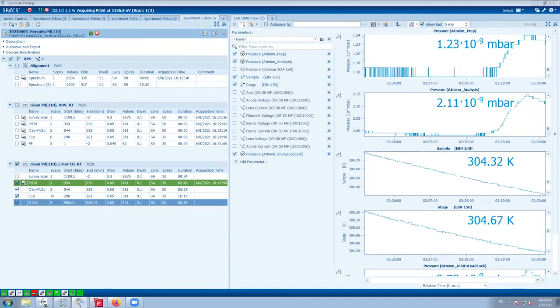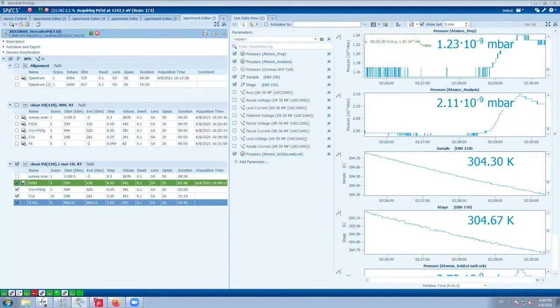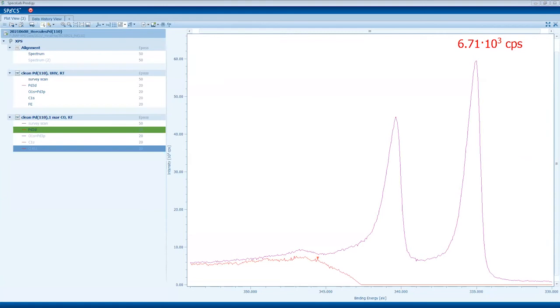You can fill the cell with a pressure of 30 millibars, but to measure it, it's possible maybe on a single crystal, which has a very intense signal. Then even if you have 10% of the signal, it's still possible to make more scans, and it's okay.